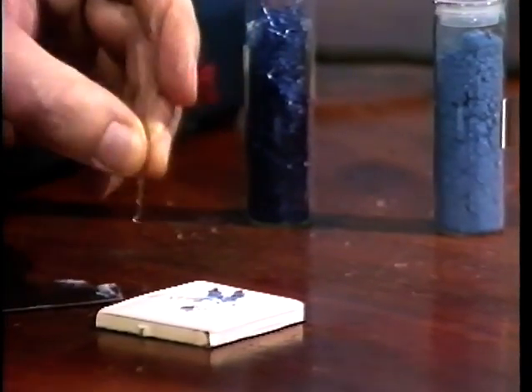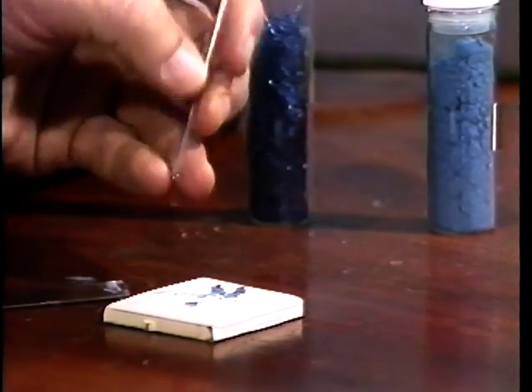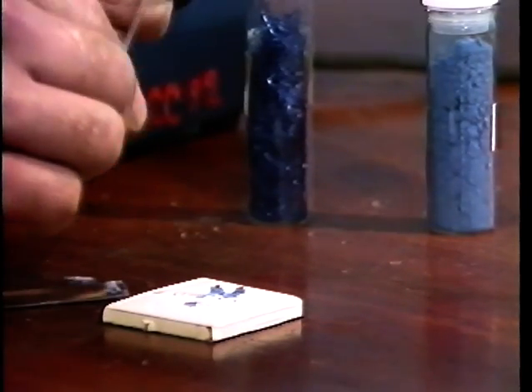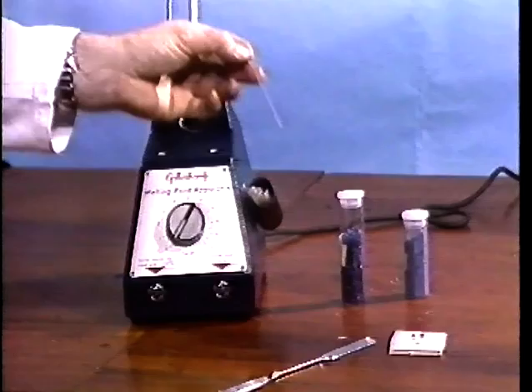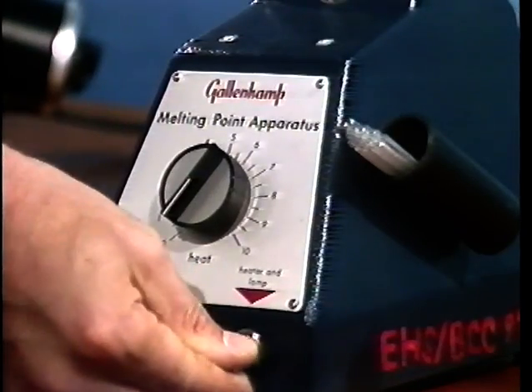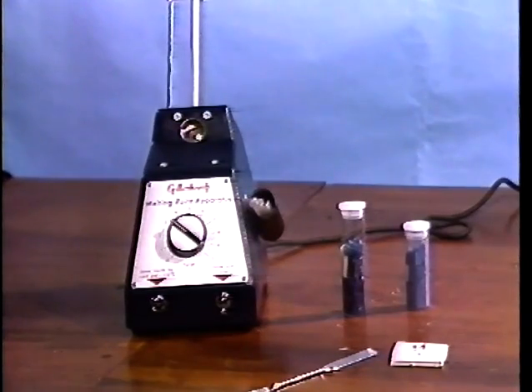Do not do this too vigorously, otherwise the tube may break. Insert the melting point tube into the melting point apparatus. Switch the heater on and set the control to a moderate value. You may then determine the point at which the solid melts.